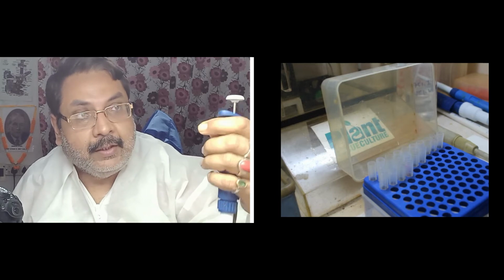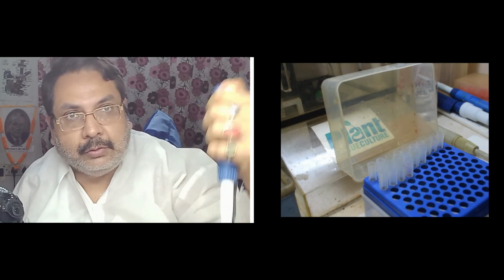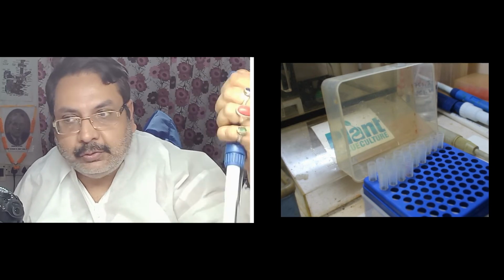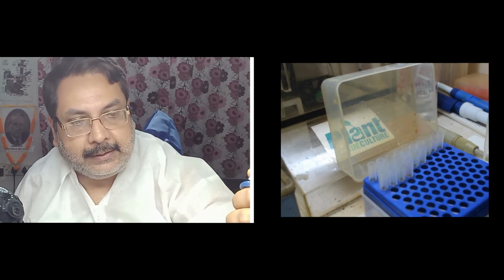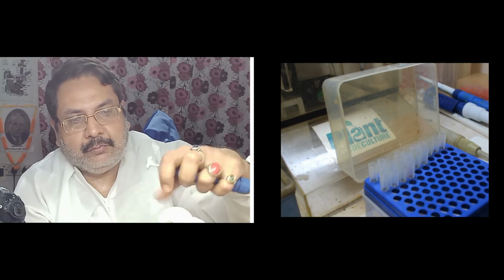And when you go to take the liquid, first push the plunger in the air. Don't put the plunger in the liquid. You push the plunger in the air, and then dip the tip inside the liquid, and slowly release. The tip will take the liquid up. So this I am going to show you now. Let us open this distilled water bottle. So here is the distilled water bottle.